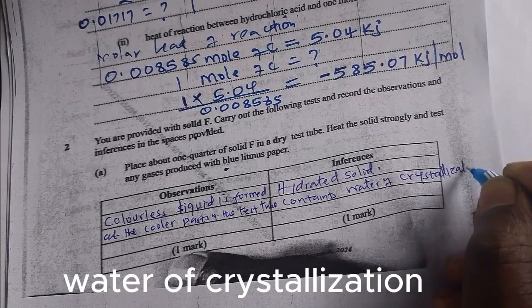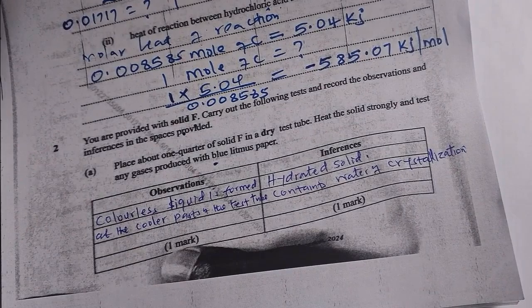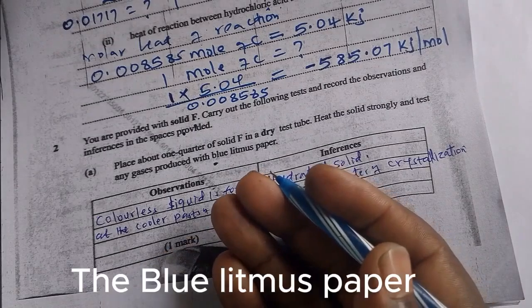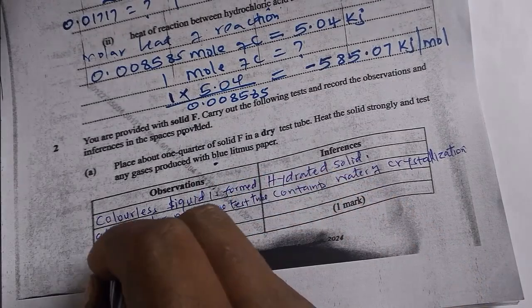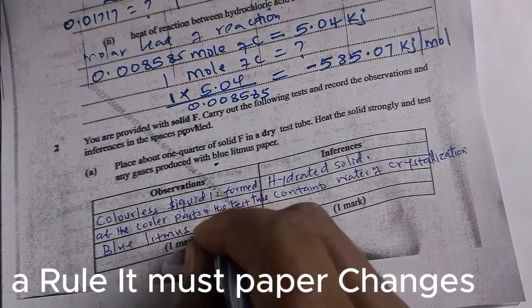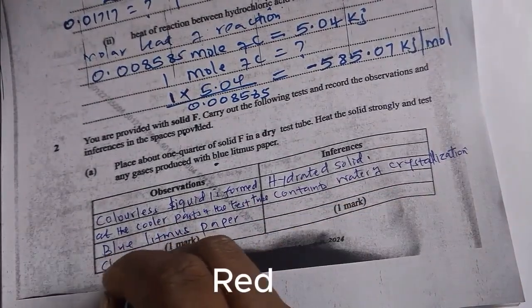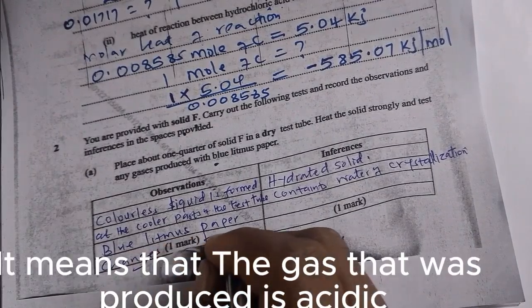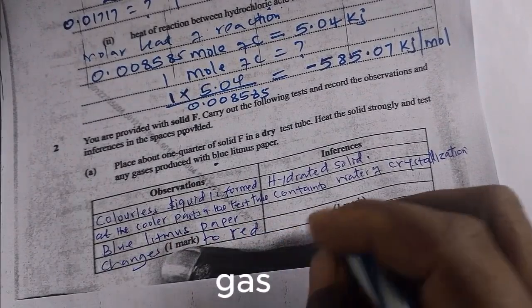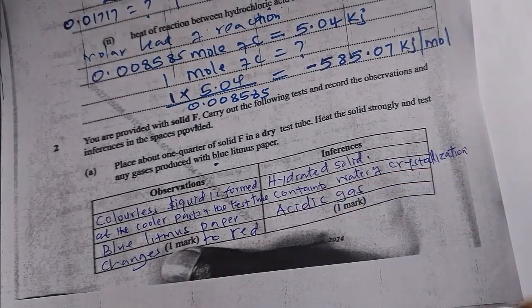Water of crystallization. What will happen to the blue litmus paper? Most probably the blue litmus paper will change to red, or it will remain blue. In this case, the blue litmus paper changes to red. If it changes to red, it means that the gas that was produced is acidic. So, acidic gas present.